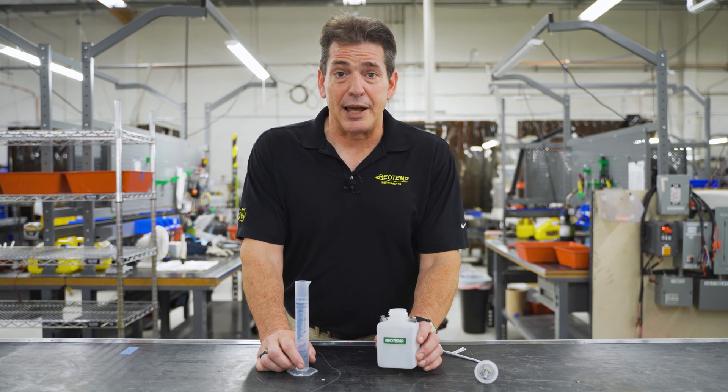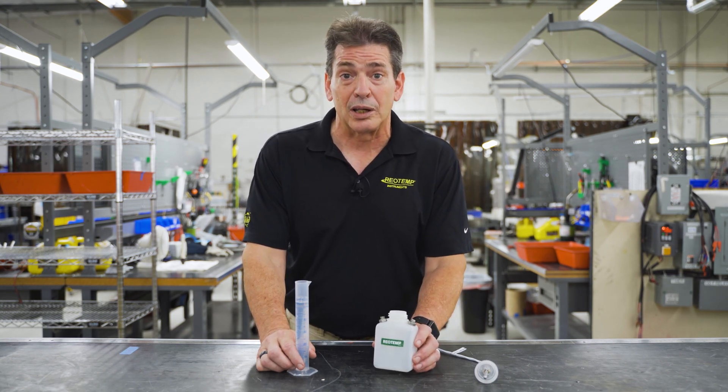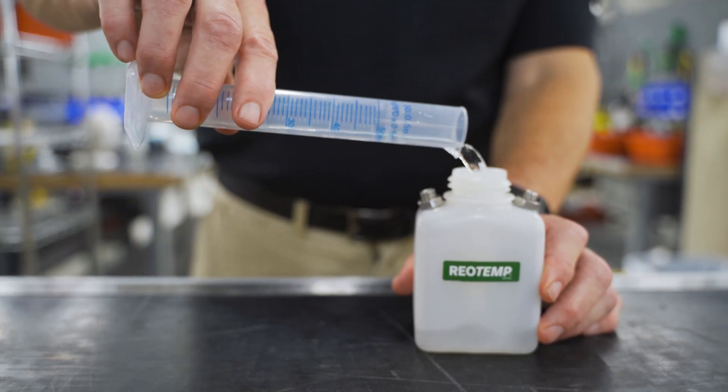The user can fill these thermal isolation bottles with a liquid such as water or glycerin or alcohol, usually something that resembles the specific heat properties of their intended sample.